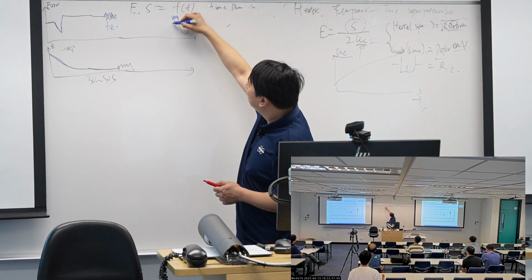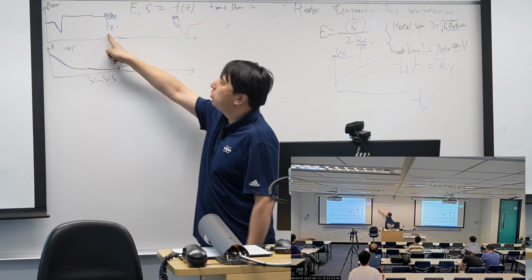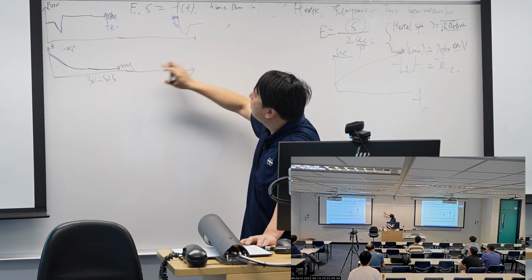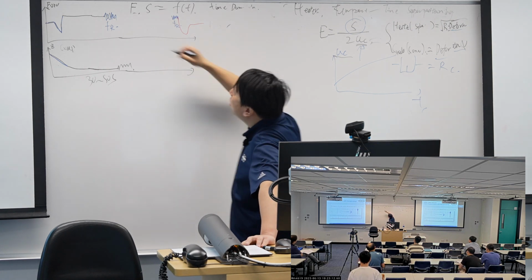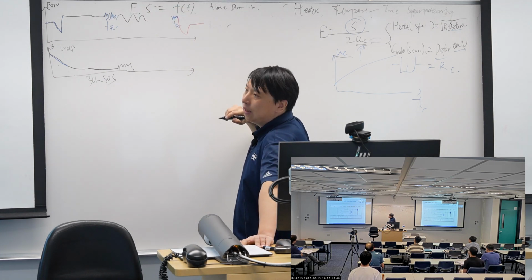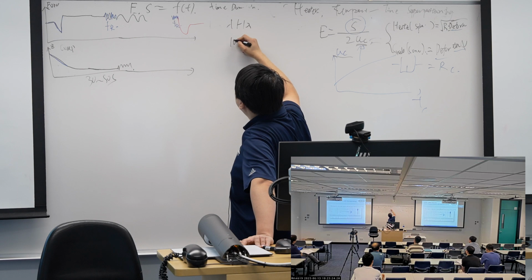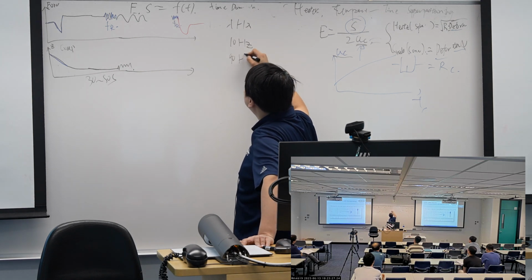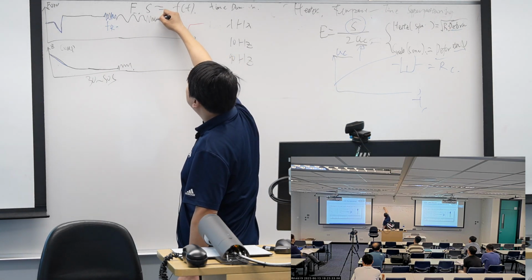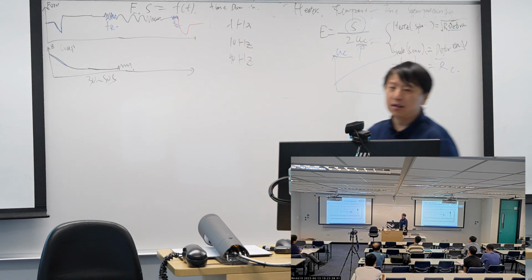We start with the reference frequency and end with the reference frequency. Inside this scripting, we can do our designed frequencies. For example, we want to do 1 Hertz, 10 Hertz, and 90 Hertz. We do 1 Hertz and then 10 Hertz and 90 Hertz, and then we reach our FR again.